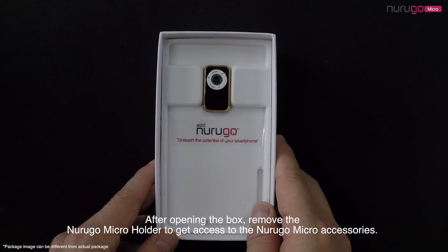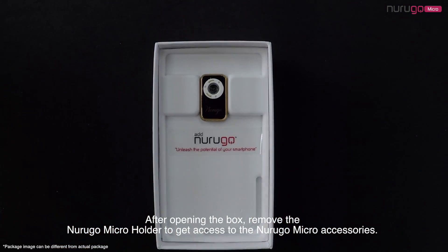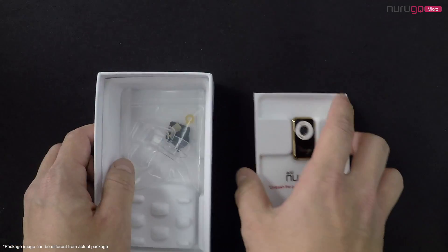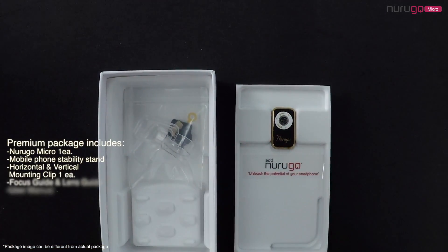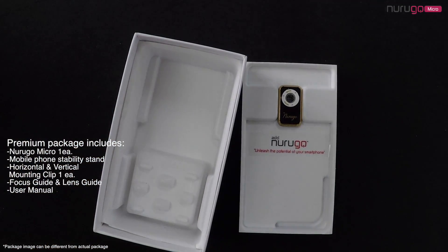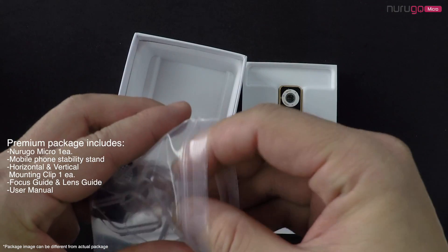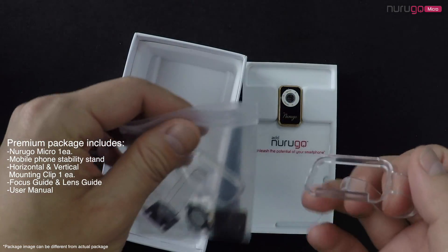After opening the box, remove the Nurugo Micro holder to get access to the Nurugo Micro accessories. The Nurugo box will include a Nurugo Micro, a mobile phone stability stand, a vertical and horizontal mounting clip, a focus and lens guide, and user manual.